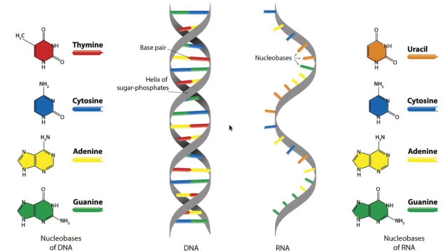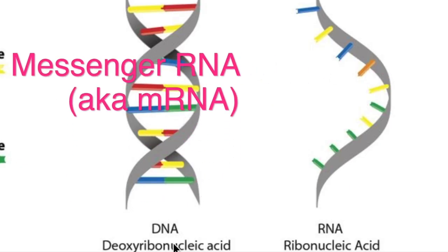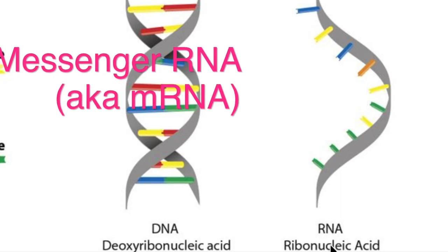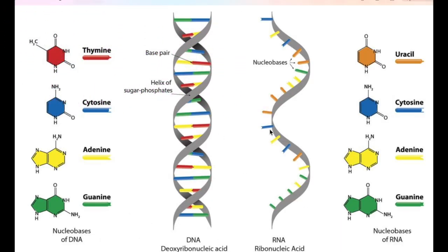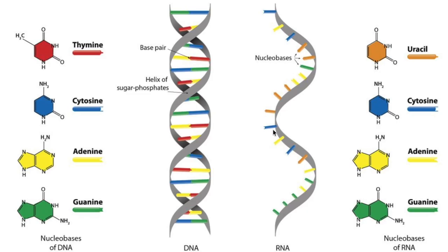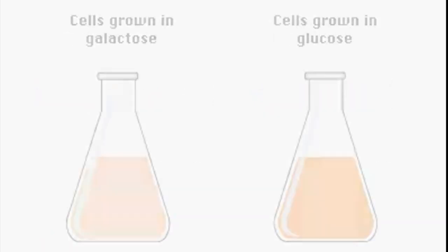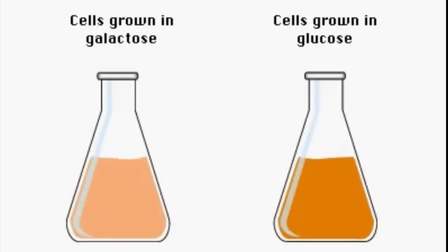Now we can do that because if you have a look at this diagram, DNA is transcribed into messenger RNA or mRNA, and this is then translated into a protein, and the protein will then carry out a biological function in a cell. So when we perform transcriptomics analysis, as the name implies, we are focusing on the level of the messenger RNA or the transcripts. So when you want to compare or determine gene expression levels, you could use different methods.